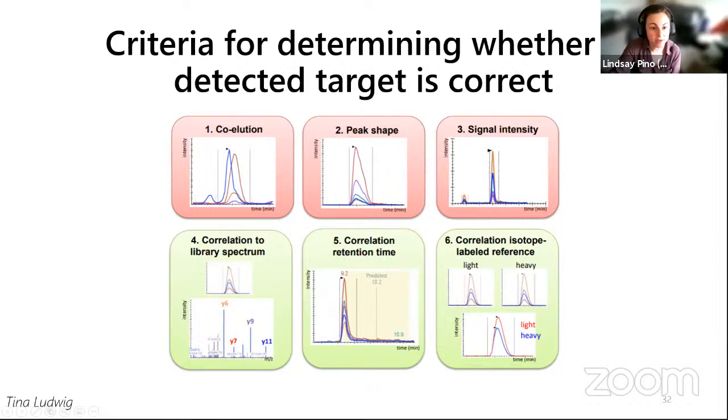So I wanted to pause real quick before we go on and clear out some of the questions. So the MZ in Skyline, 99% of the time when you're looking at the mass to charge, it's going to be the fragment level. Skyline does include precursor level information. You can pull in MS1 scans and look at the isotope distribution for your precursors. 99% of the time in Skyline, we're going to be looking at fragments though.